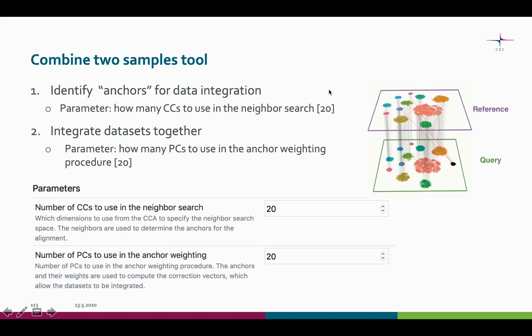In Chipster, we offer two parameters for this combination step. The first parameter, number of CCs to use in the neighbor search, is used in the anchor identification step. The second parameter gives the number of principal components to use in the anchor weighting process. Both have a default value of 20 and you can well start with those default values.